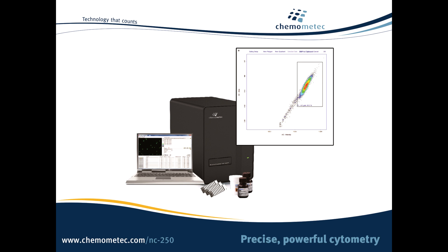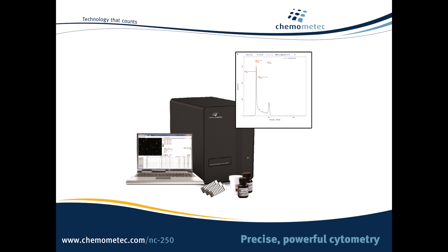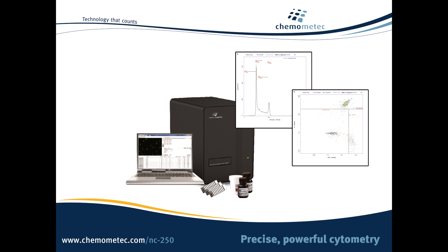But that's not all. The NC250 allows you to do more than just cell counting. Choose between a quick and powerful cell cycle assay and the Vitality assay, which lets you assess the health of your cells before they start to die.